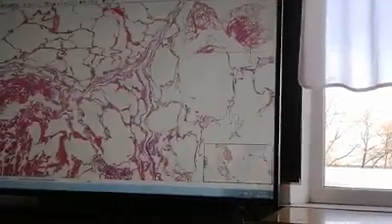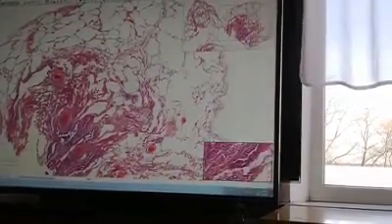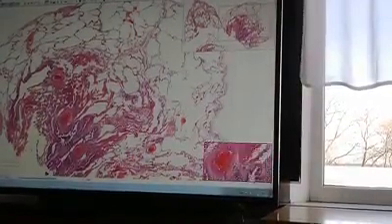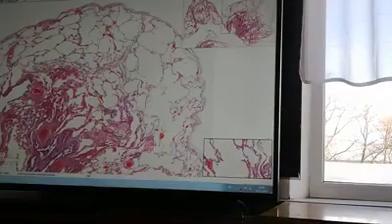And also a sclerotic process can be found around the bronchi. That also tells us that the reason was chronic bronchitis. You can find growth of connective tissue around the bronchial wall, in the peribronchial space. It's emphysema of the lungs.